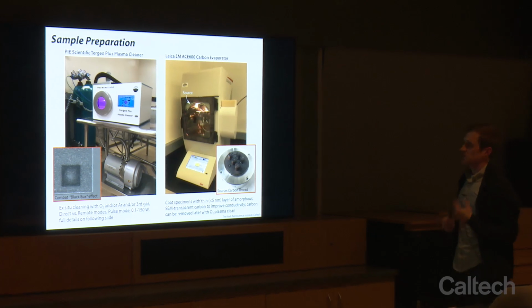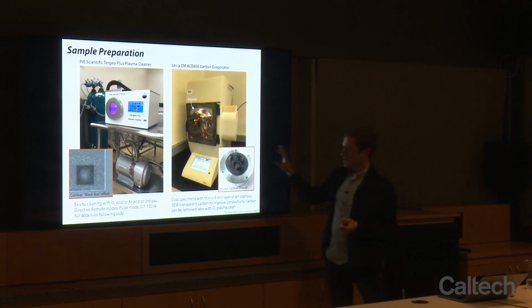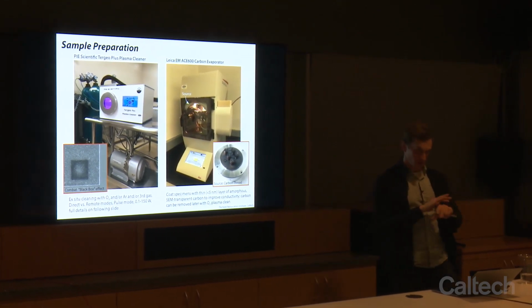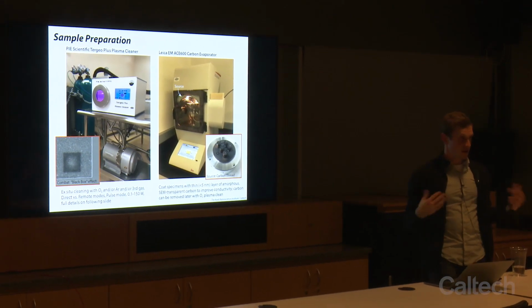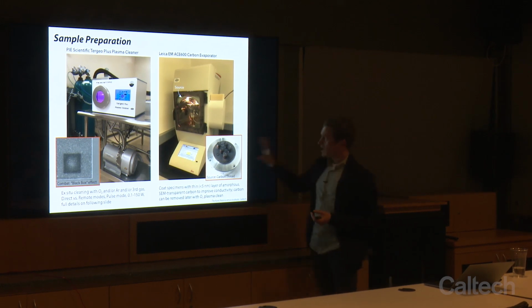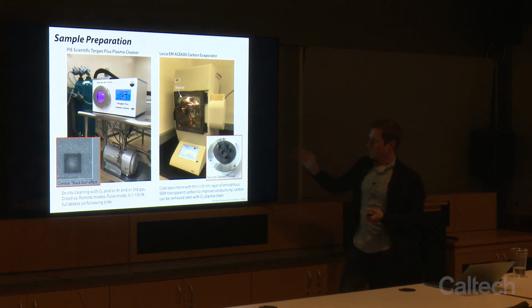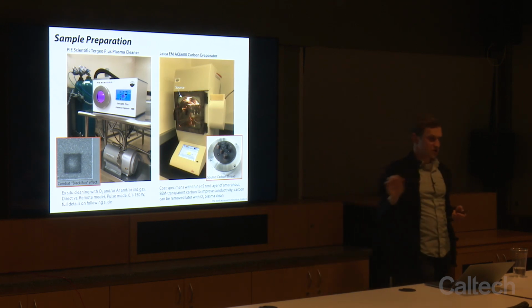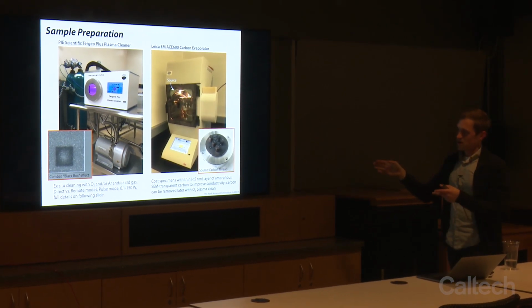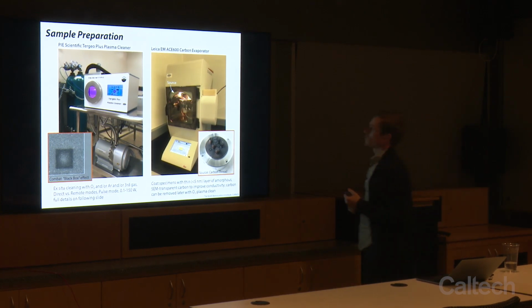Something else we have in the lab, sample preparation. I mentioned, well, if your sample is not conductive, then you can go to lower voltage. And I usually train people to do that because people don't often want to coat their devices with a conductive material because they want to still make measurements on them. But if you're able to, you can coat your specimen with, say, carbon. We have a carbon evaporator. And this puts down like 5 nanometers of amorphous carbon. You won't see it in your image at all, even if you're imaging at the highest magnifications. And it's really conductive and works really well.